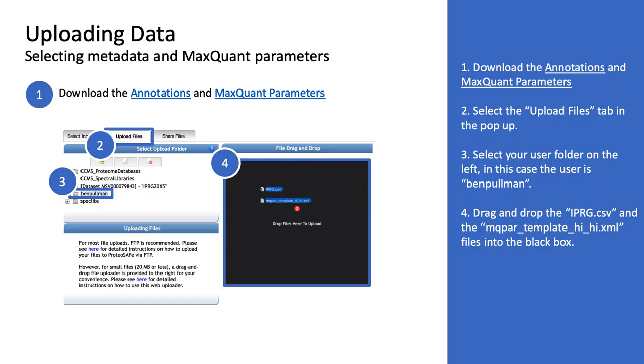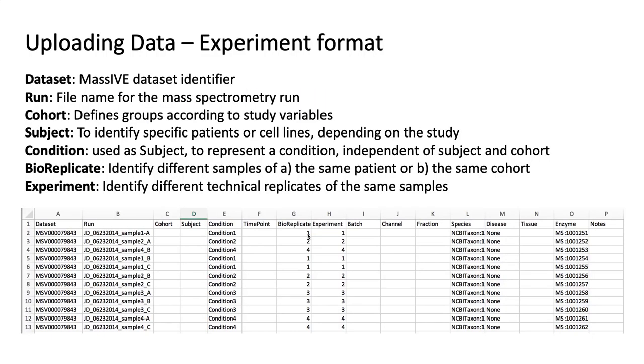So if all went well, they will show up in the system so that you can now use them as inputs to other things. All right, so then a couple of notes. Next one is just what is this experiment format? How is it represented in here?